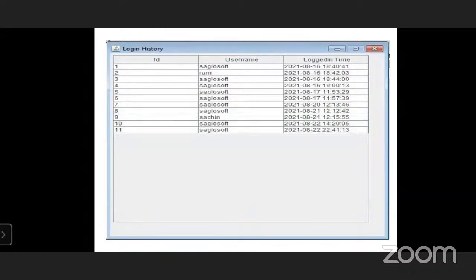And that software is sold to that RAM, that particular person, and RAM again logs into that software at this time and this date. So ह्याच्यामध्ये तुम्ही बघू शकता की मल्टिपल युजर्स कधी लॉग इन झालेत आणि कधी लॉग आउट झालेत. हा जे काही हिस्ट्री आहे, ही हिस्ट्री आणि ही सिस्टीम या सॉफ्टवेअरमध्ये तुम्हाला इझिली रेकॉर्ड करता येते किंवा you can generate the report by using this software. Okay.